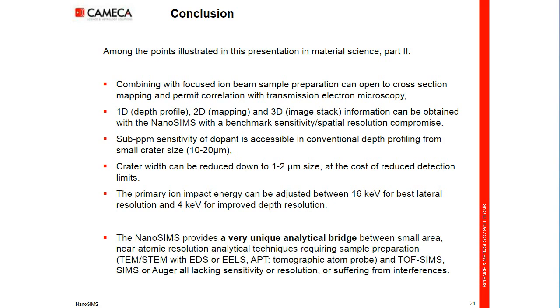So the NanoSIMS can be considered as a unique analytical bridge between very high resolution, the atomic resolution techniques like TEM or STEM or atom probe tomography, requiring a sample preparation and limited to a very small field of view.